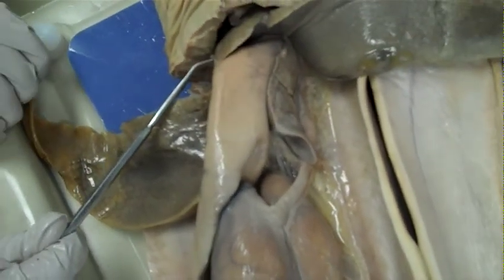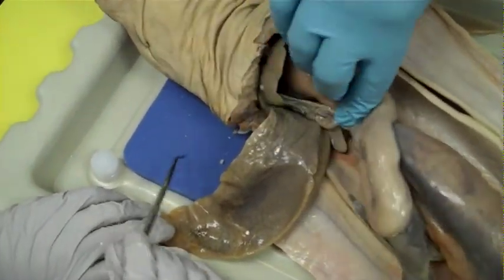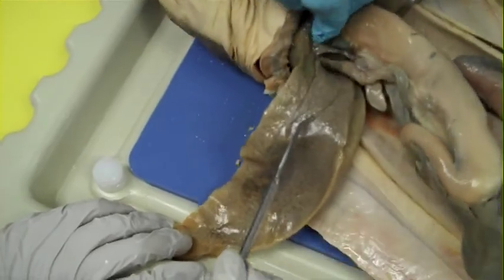Do not cut it out — we're not removing it. There is a medial lobe, and connected to that medial lobe you will see the gallbladder. See the green? That's the gallbladder.